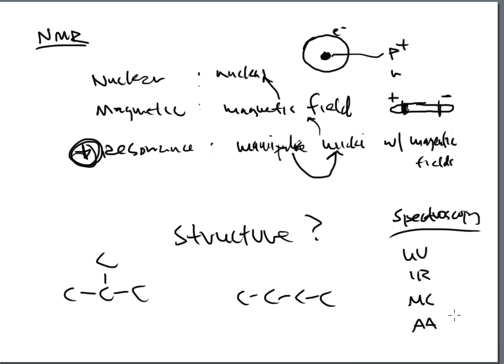The AA instrument uses light bulbs and light energy to measure things like metals, so atomic absorption, AA, atomic emission, AE, inductively coupled plasma, ICP. All of those very similar. We are putting a bulb in a way into a stream of compounds, and that compound will absorb the light energy and tell us how much metal is present. And here in NMR, very similar. However, NMR doesn't quite use a bulb, right? Not all of these have to use a bulb, but we are talking about electron energy, and this means that we are talking about the electromagnetic spectrum.